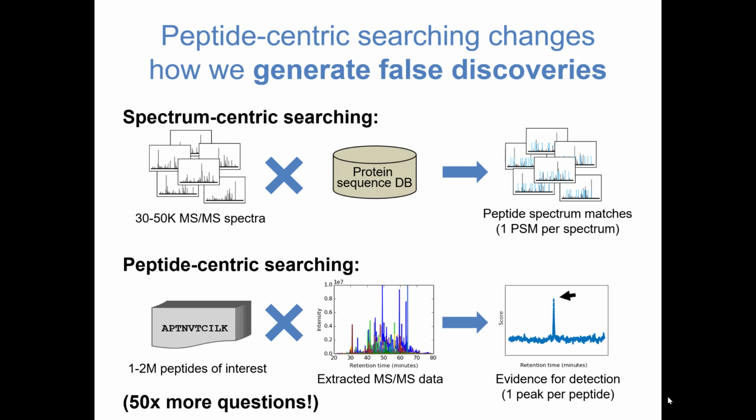Yeah. So here that might be 150,000 peptides in a human HeLa spectrum library. It's still going to be significantly more than the number of spectra. The important thing is libraries are kind of a misnomer. These are not some magical spectrum libraries. It's just some statistical priors, right? So you've got some retention time constraints, and you've got some fragment ions that are a little bit better to use than all the fragment ions. But you can do it without those priors, without any retention time information, and without any knowledge of which fragment ions.